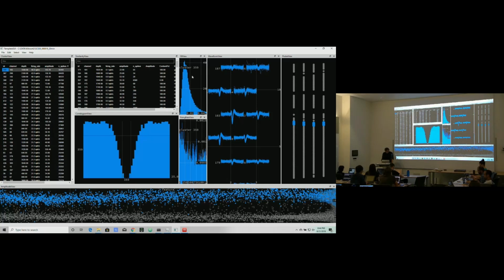And there's another view that is kind of an extension of that one. It's a newer view in Phy 2 called the ISI view. It's really the same, but it's done on a logarithmic scale. So what's happening here in the ISI view is we just have half of this correlogram. Okay, not quite that. It's a distribution of just the ISIs. Okay, so there's one little difference.